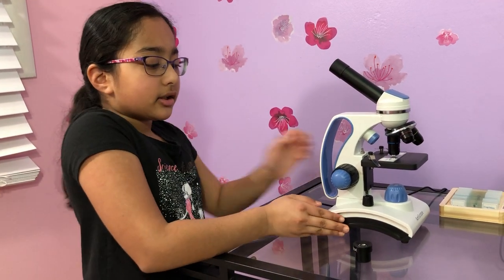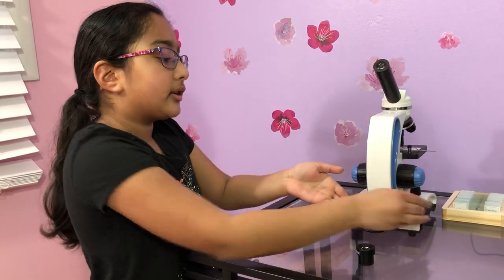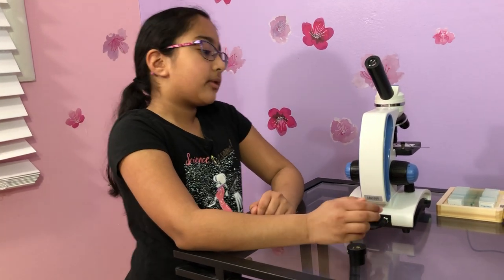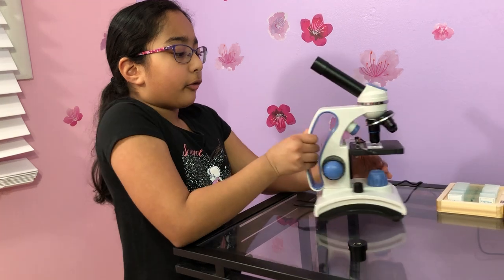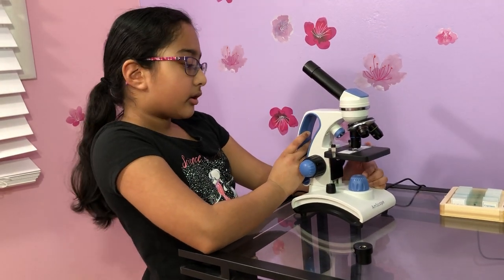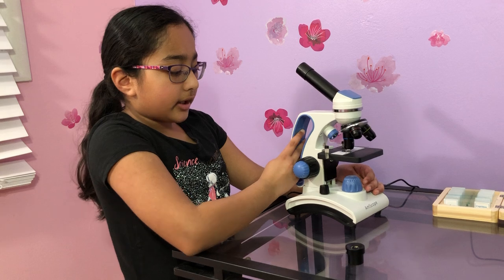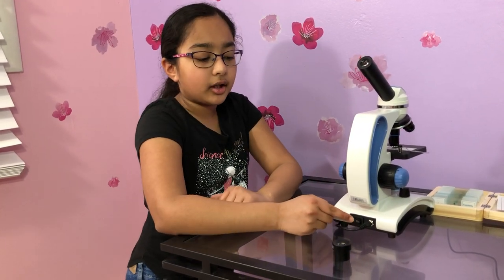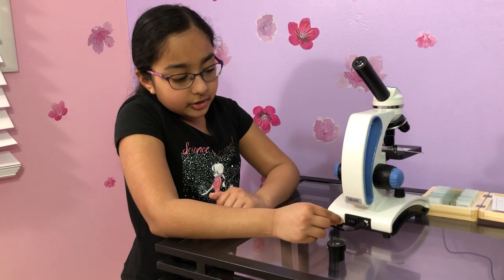Here's the base, and over here you can see this is a cable. Some microscopes don't have a cable because instead of a light they have a mirror that reflects light. Over here I also have an on and off switch — right now it's off.